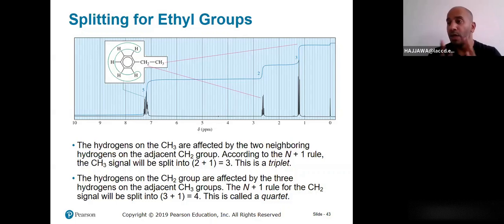Keep that in mind. You could link it this way. Deshielding happens, taking it more downfield. Shielding happens, makes it go upfield, and so on. Okay, upfield goes toward the 0, downfield goes towards the higher ppm values. So that's one: figuring out that CH2 is going to be more downfield than CH3.